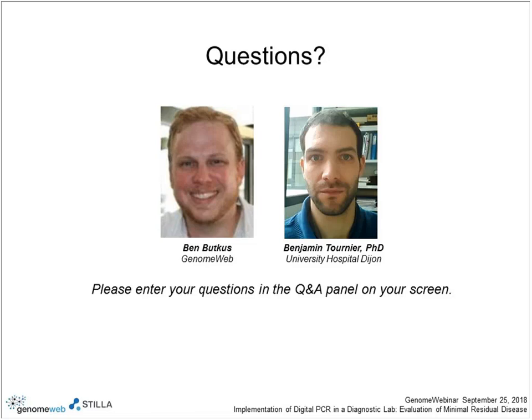Thank you. The next question, how long does it take from droplet generation to data with the Naica system? So, firstly, you have to prepare your PCR mixture.